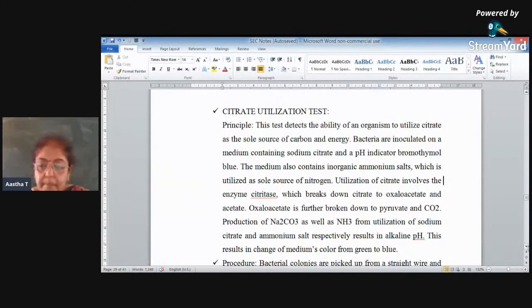Last test is citrate utilization test. So what is the principle of citrate utilization test? That we'll see.